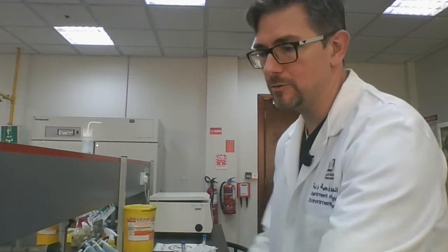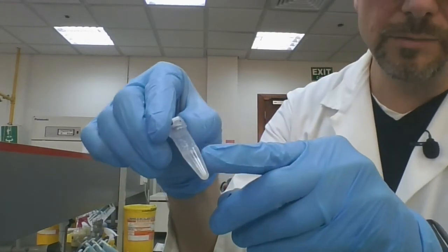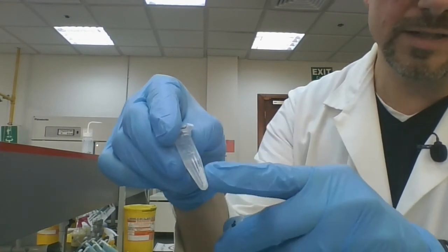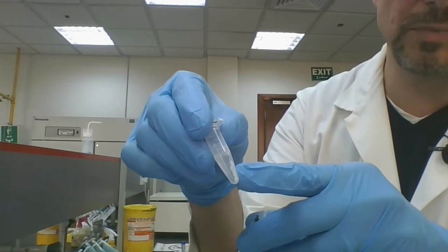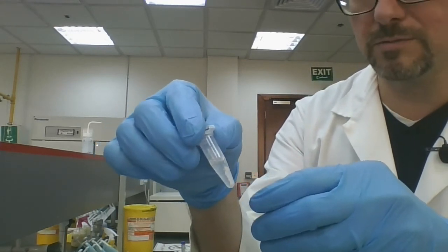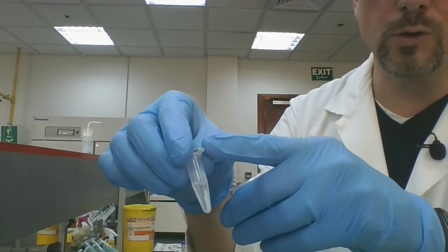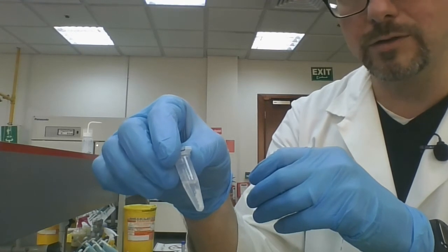Okay, we're back, and our centrifugation is finished. So I'm going to take my samples out of the centrifuge, and what we're going to see is that we have a whole bunch of the pellet along the edges, exactly where my hinge is. Okay. Now in this case, it doesn't really matter because we're not looking for this pellet. We're not trying to collect this pellet. But again, later on in this procedure, you're going to be collecting DNA, and it's going to be a very, very small amount. If you know that you always have the hinges out towards the outside, you will always know where to look for your pellet, okay?